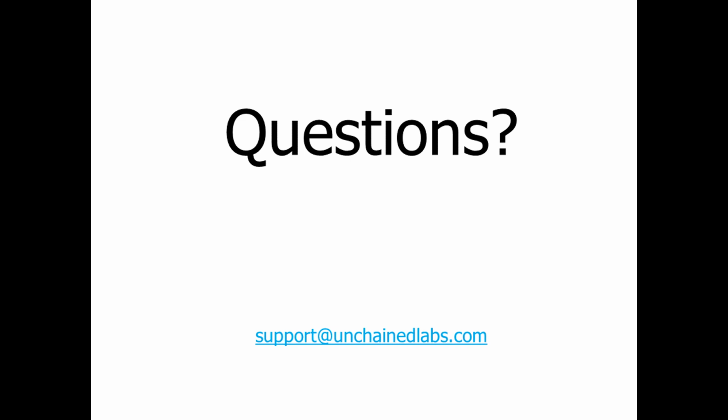Thank you. Our next question: how can I handle multiple systems in my lab if I'm working on designs at my desk? So the way to handle it at your desk, most customers will have set up, if they have one instrument, they may have the instrument available on a rack server. So in those particular instances, you will be able to retrieve and identify your system essentially through the server already. If you have multiple systems at your site, you will be able to choose among those.